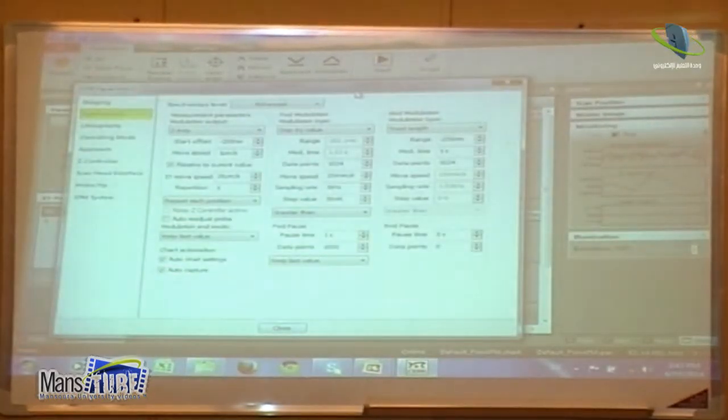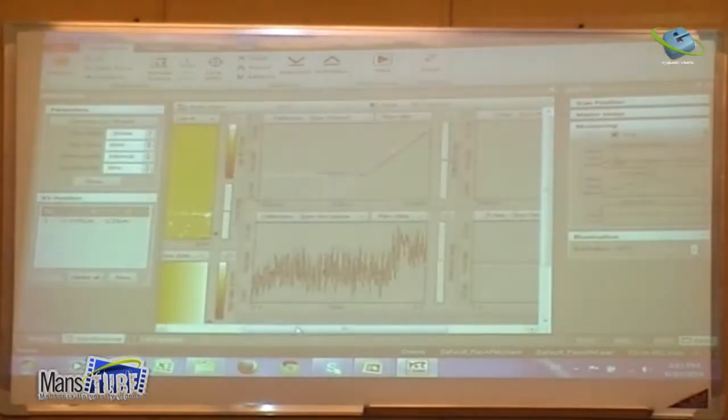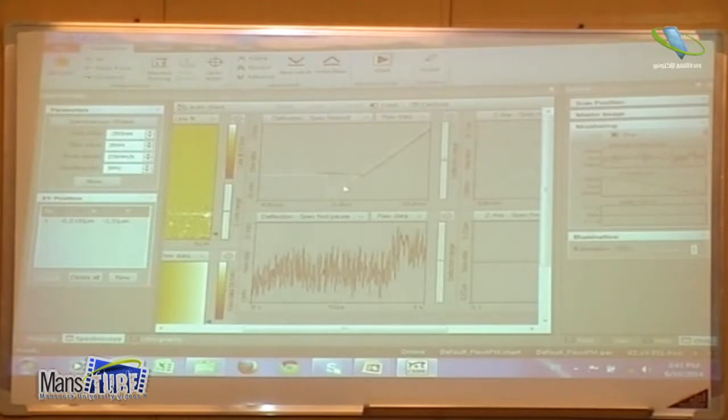I can send you something, a basic model. You can use this to start the advanced spectroscopy. But the idea is that you can start far from the surface, and then you go down and go back, and go down and go back. And of course, you need some practice. What is important is that with the spectroscopy you can measure the adhesion force. You see that it's clear, and then you can measure the slope here. This is spectroscopy.